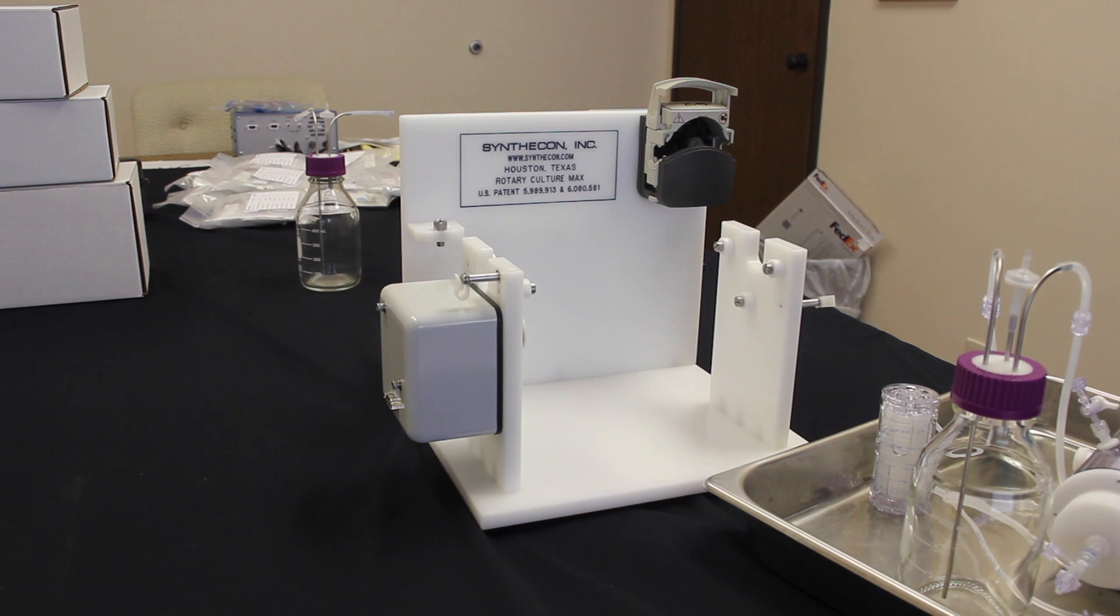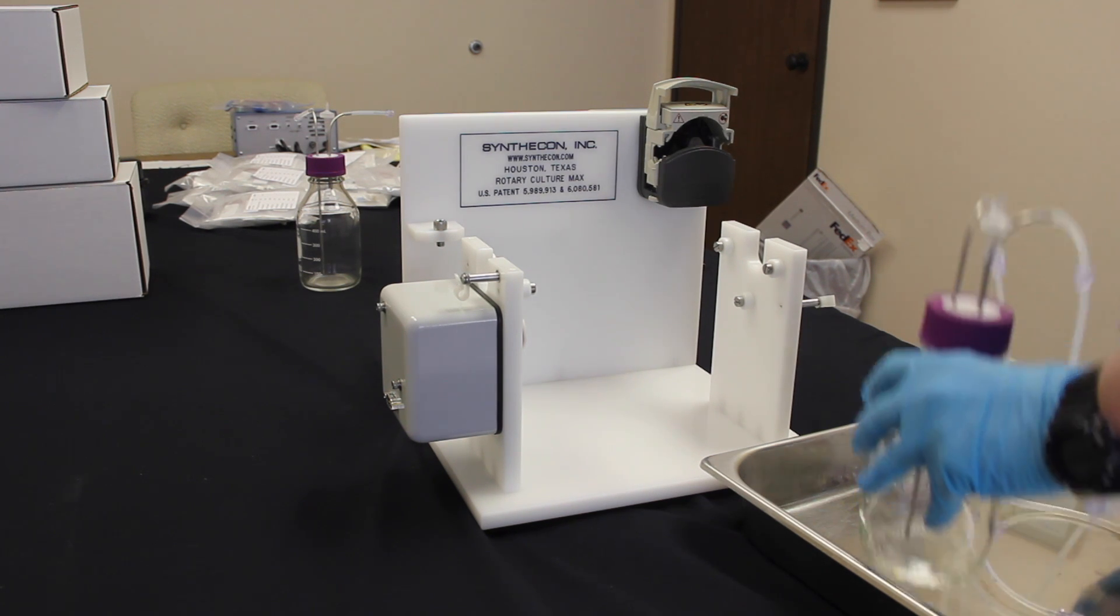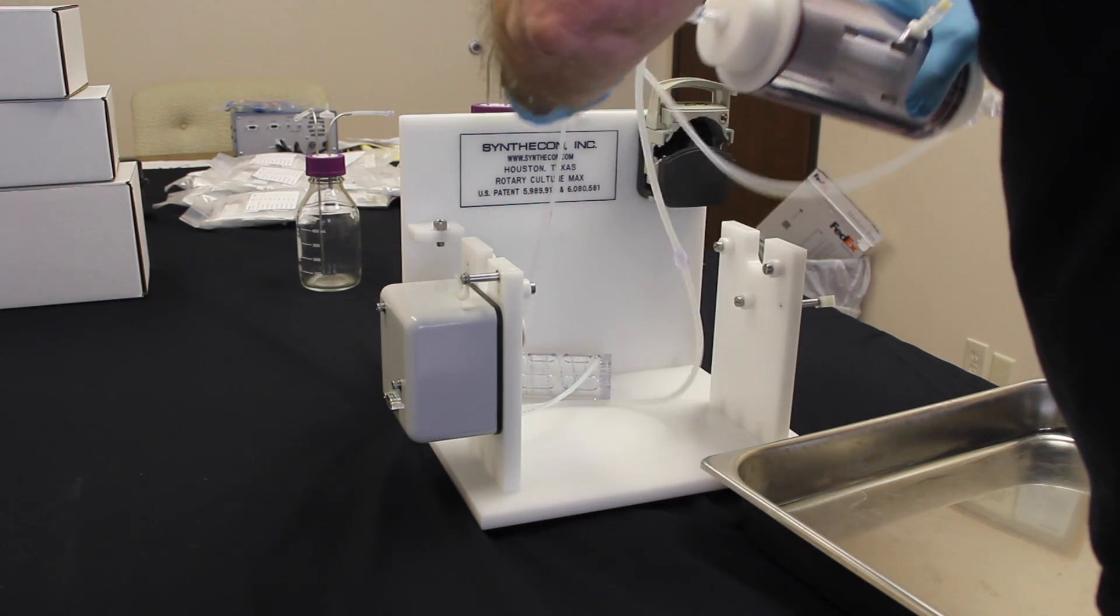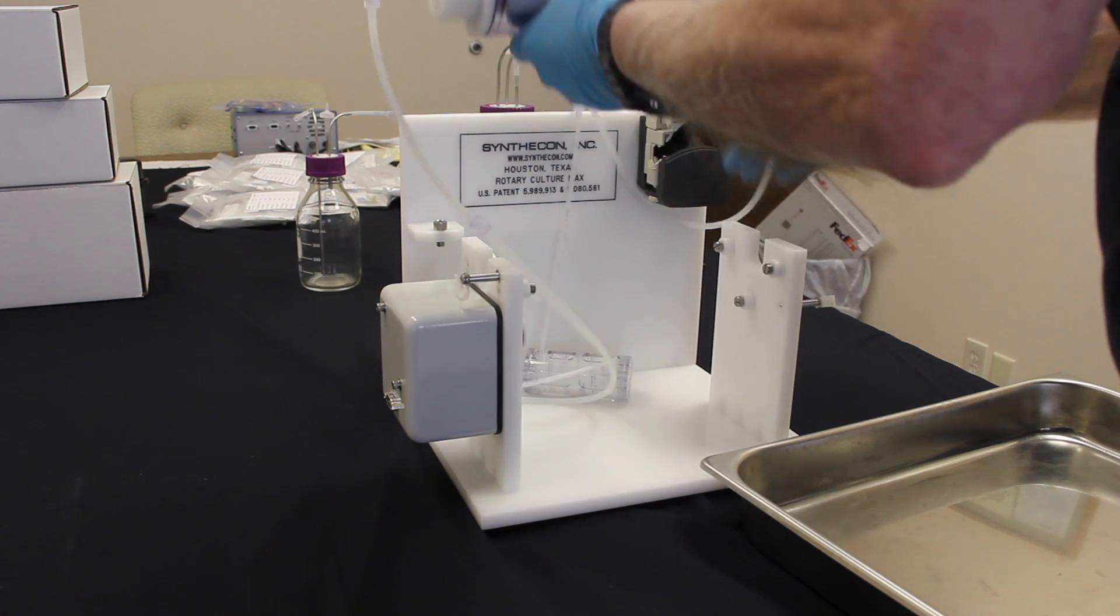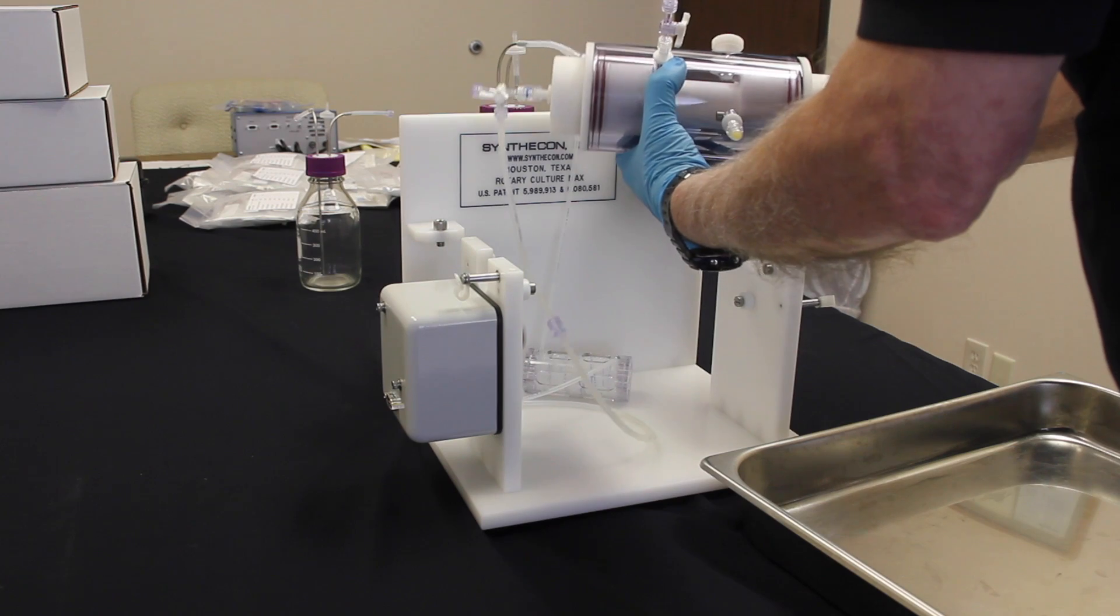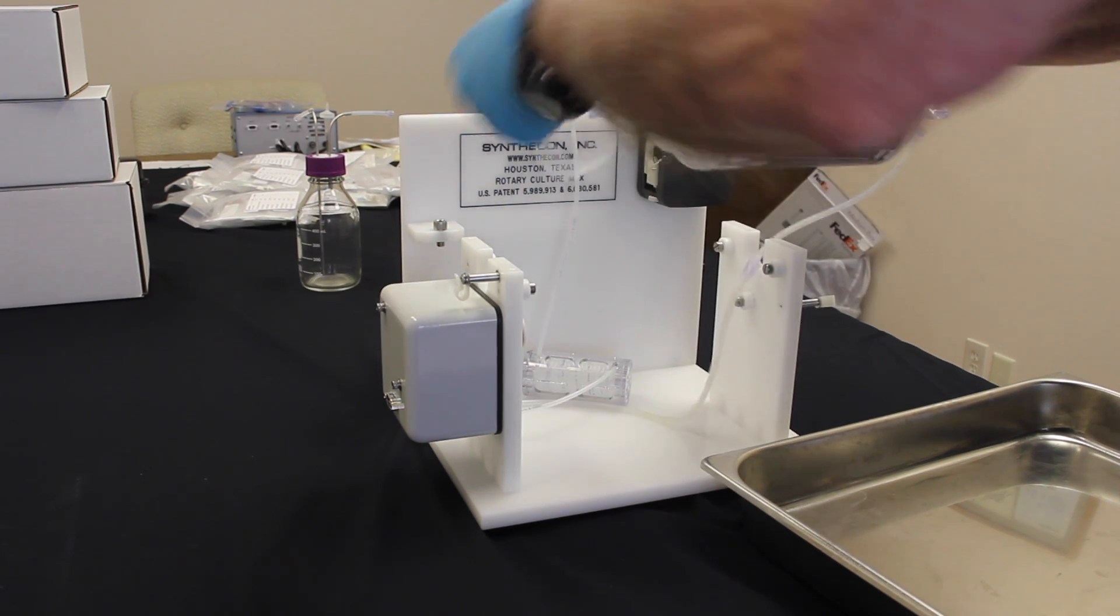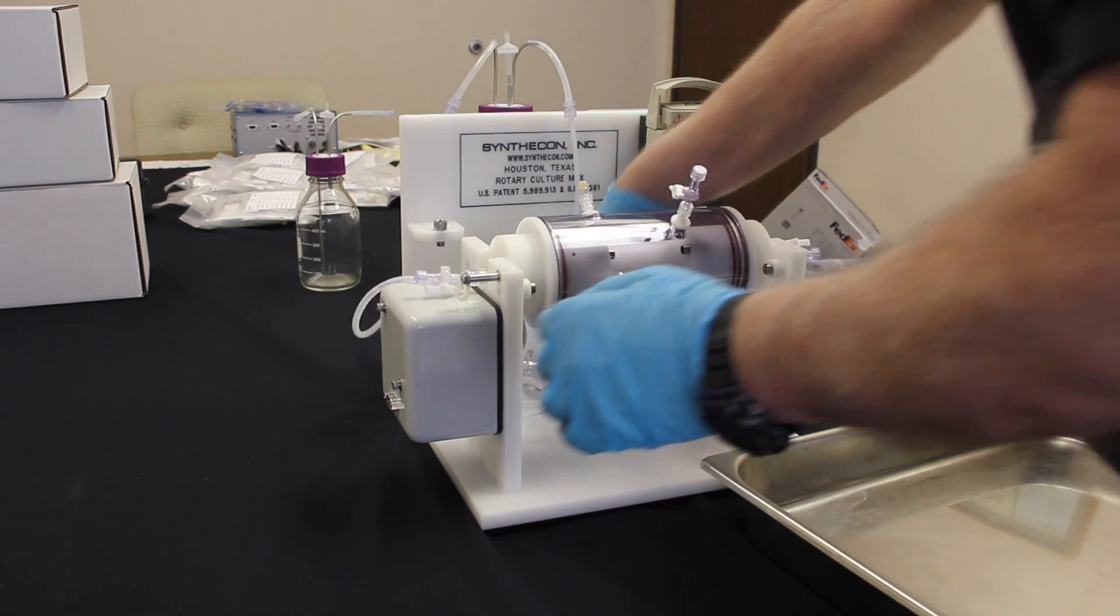Okay, we now have our assembly that we have brought over to the rotator base. First, you can take the vessel and the media bottle. Place the media bottle in the reservoir, basically the space that holds the bottle in the back of the rotator base. Then, paying attention to the inflow and the outflow sides, you have to turn the vessel in the correct orientation and place it in its cradle.